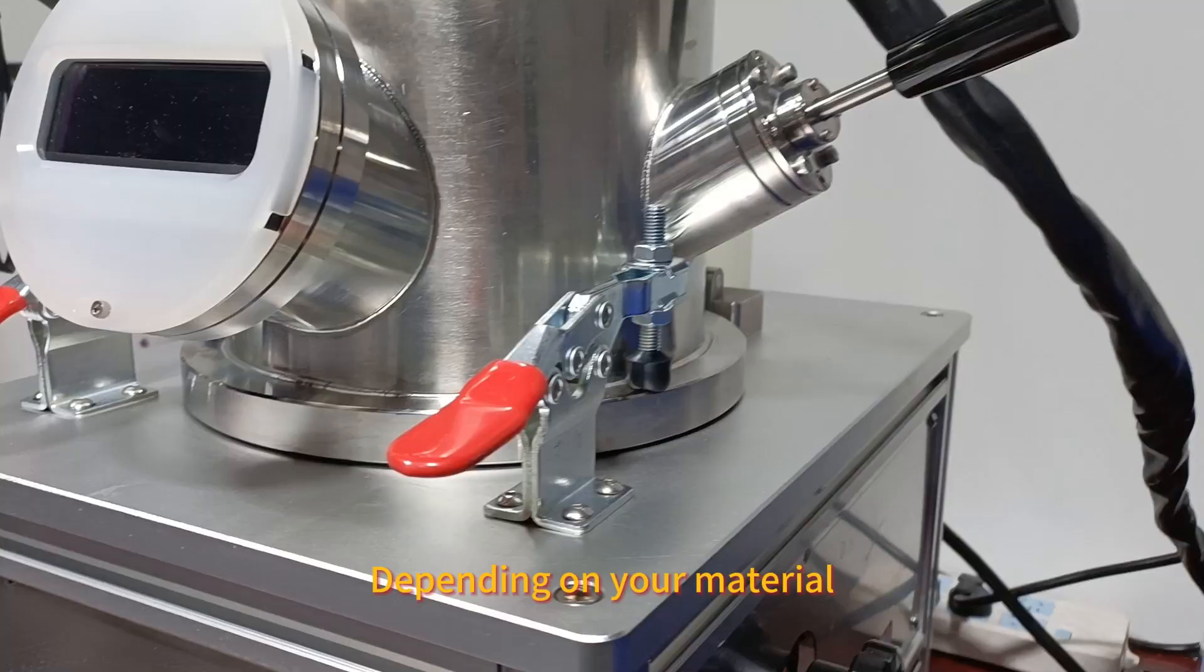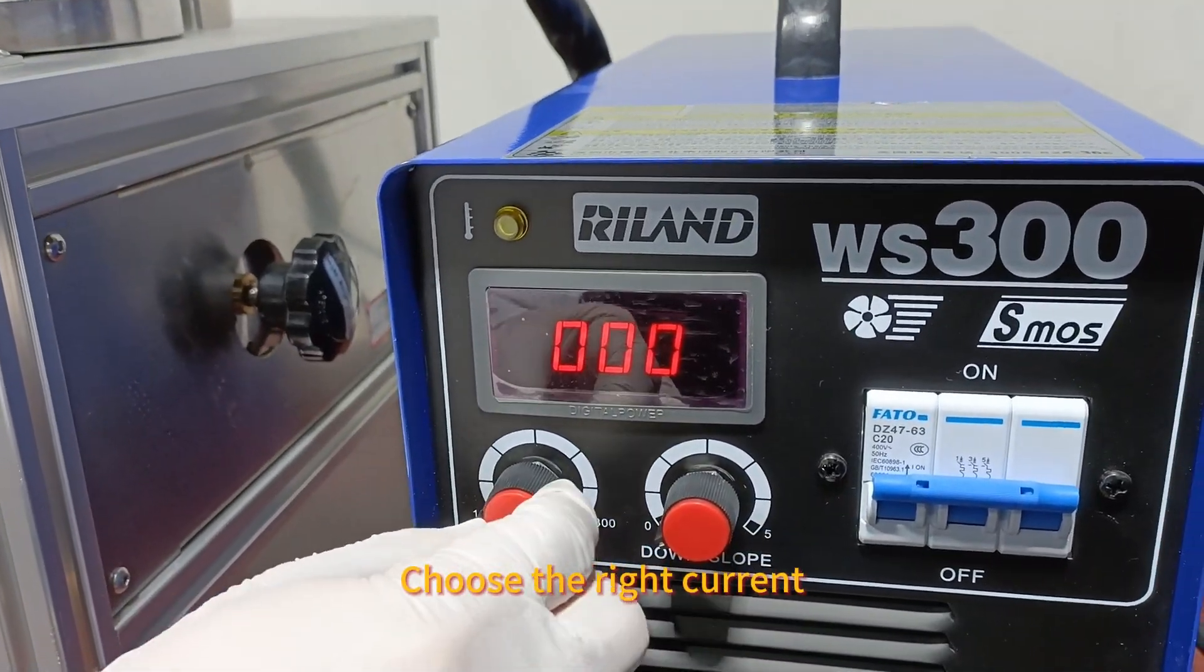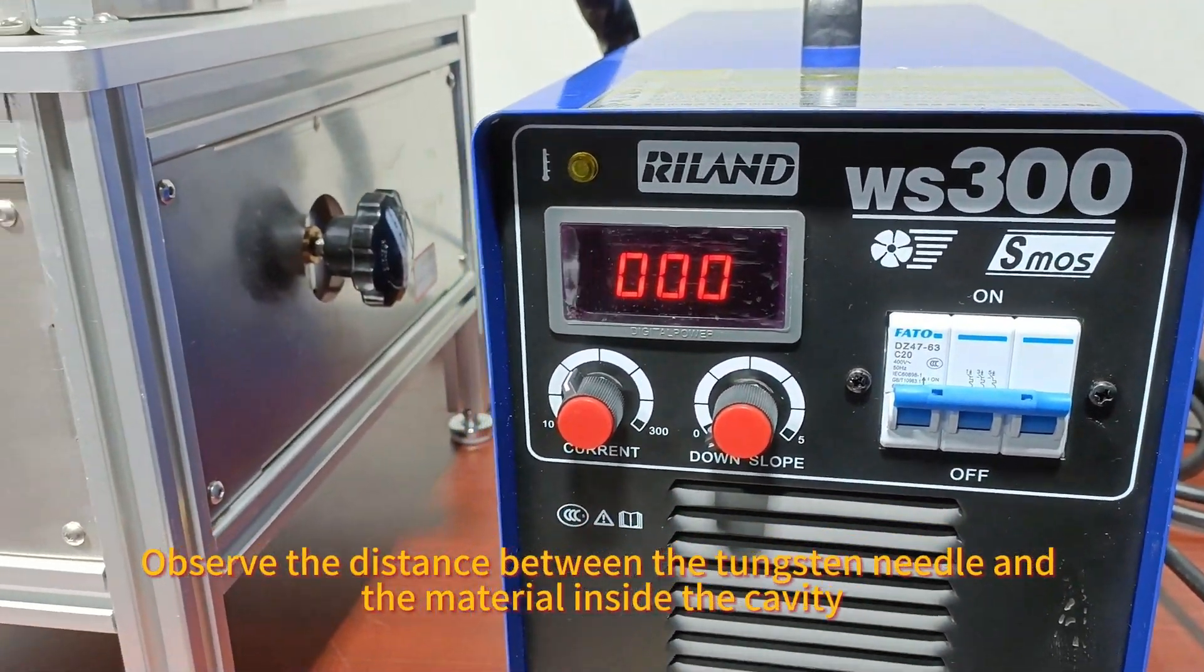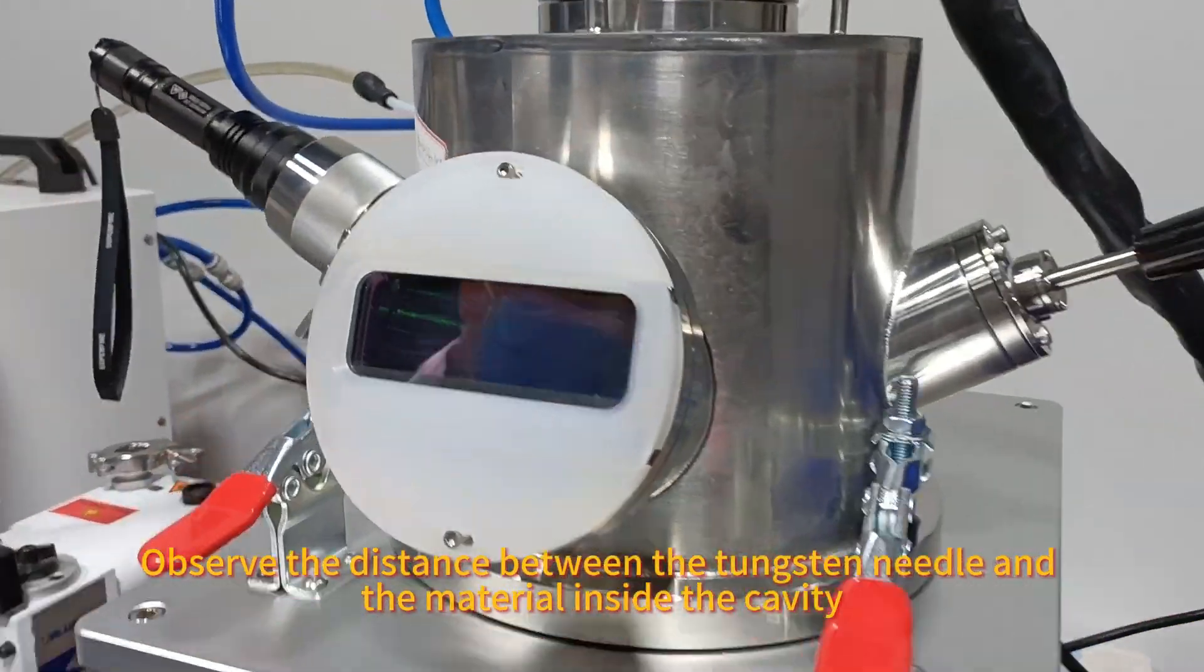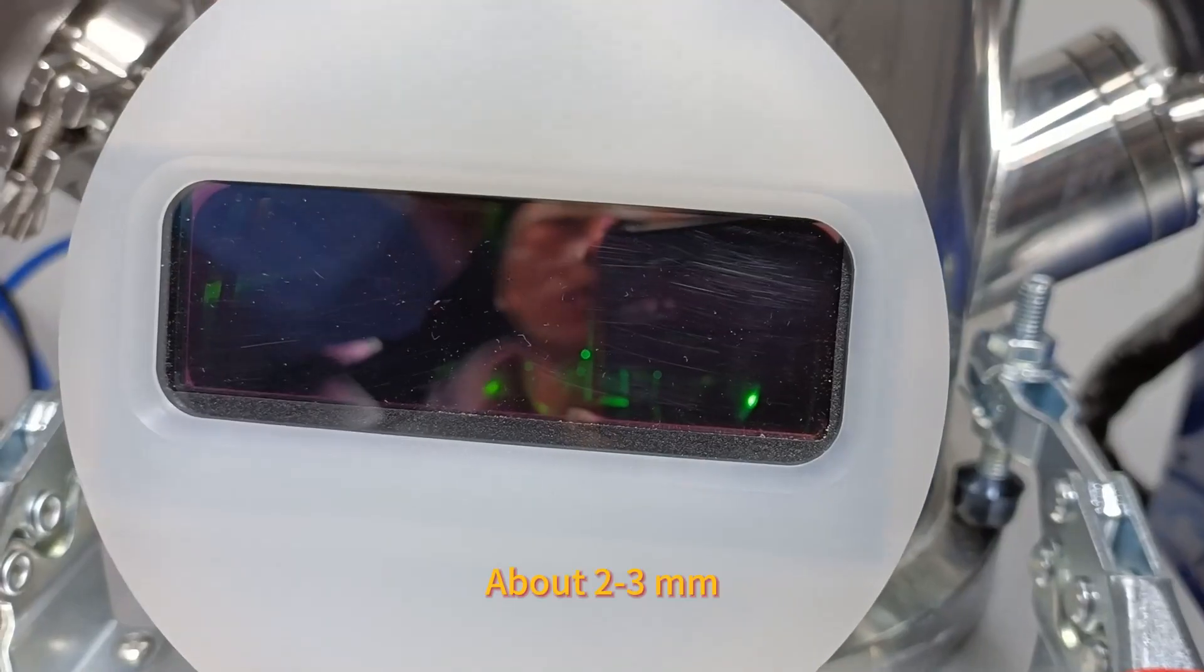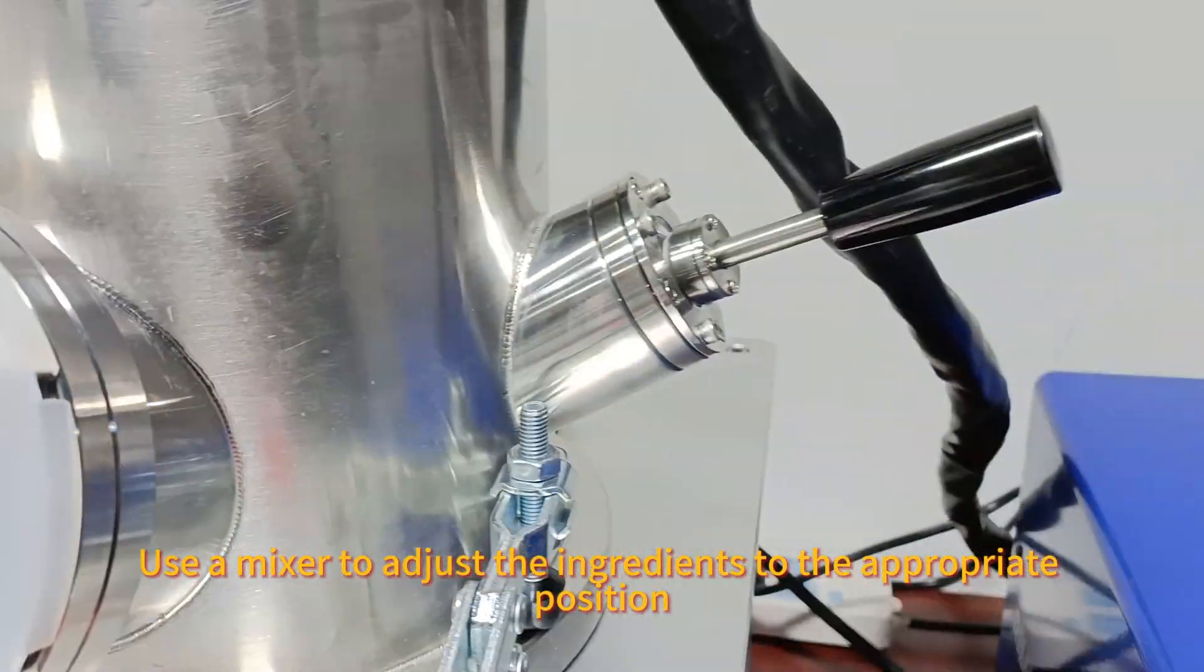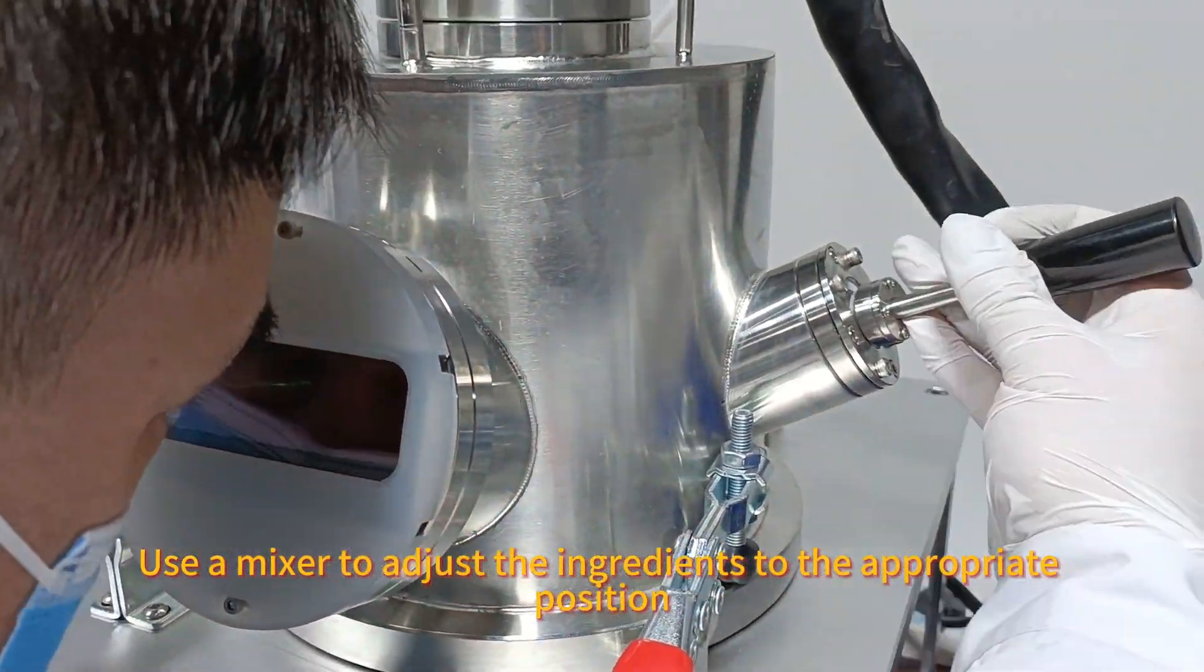Depending on your material, choose the right current. Observe the distance between the tungsten needle and the material inside the cavity, about 2-3 millimeters. Use a mixer to adjust the ingredients to the appropriate position.